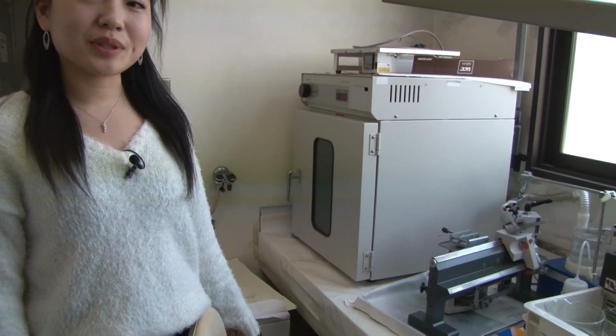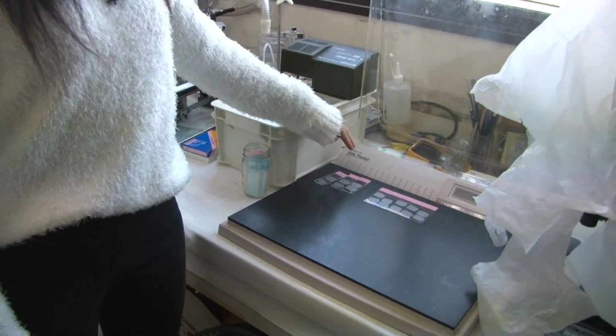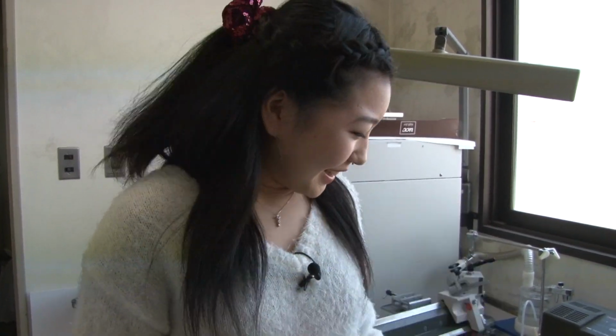Here, we can make tissue sections for HE or histochemistry. Last night was my first attempt at making these tissue sections. Today, I'm planning to use these sections for... Oops, I think I stuck these on the wrong side. Let's move on.